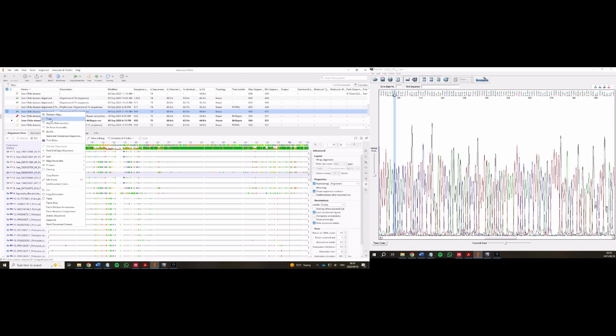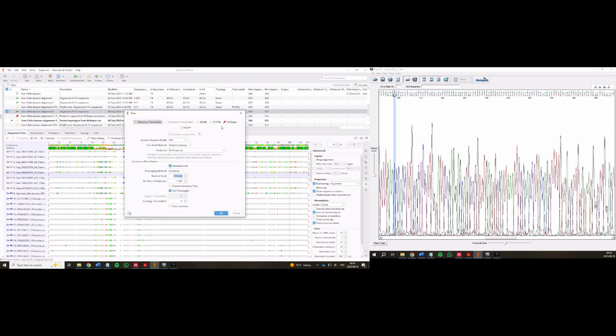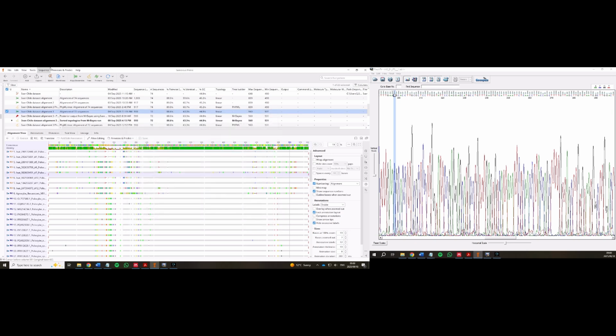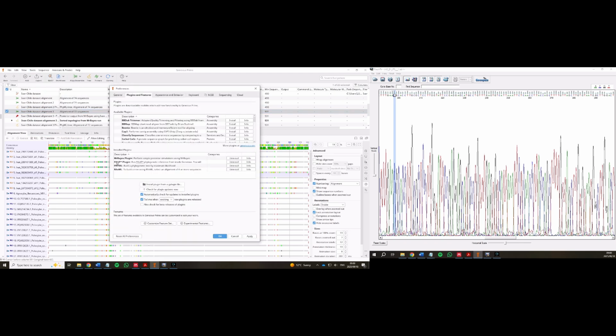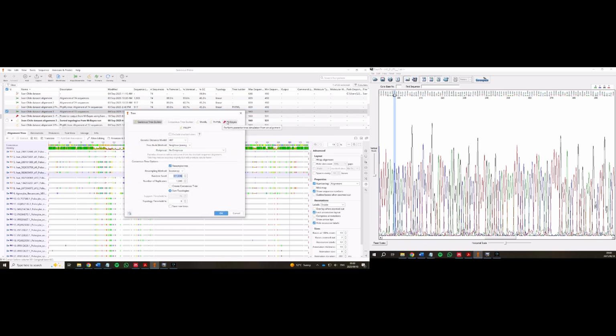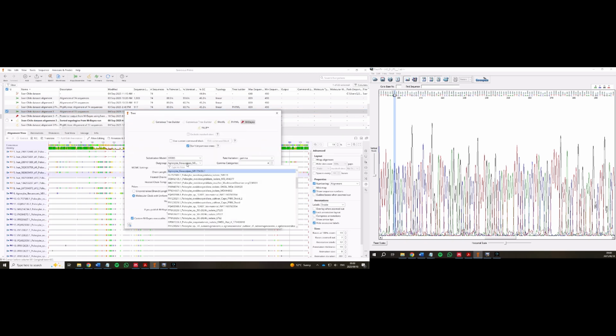The MrBayes tree is a good one to do. You can just copy paste these same parameters as what I have there. To install MrBayes in Geneious Prime, you can just go to plugins and download the MrBayes plugin. You should be able to get a 1 month free trial for Geneious Prime to make these trees. All right, back to MrBayes. You select your outgroup. It should be the outgroup species you chose, and for these parameters, a chain length of around 5 million is good, and then the burn-in length should be around 25%. You can also do a little bit less than that.